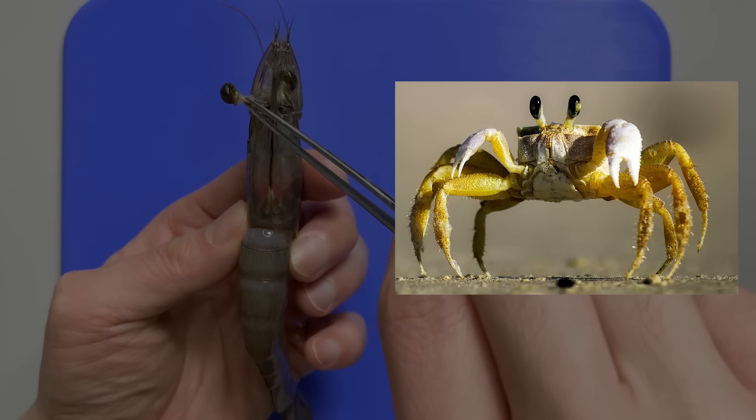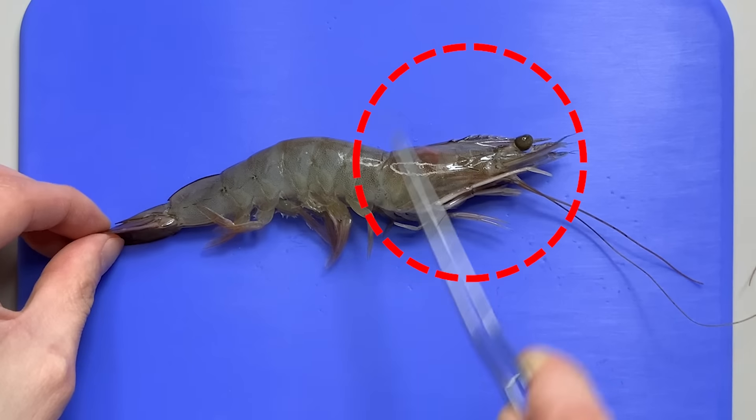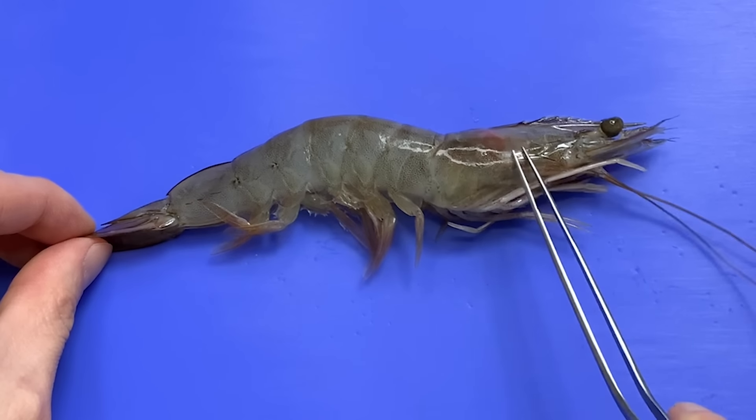First of all, if you look at the outside of the shrimp, there's a part you should be careful about when you eat shrimp. It's the rostrum. People use the rostrum to distinguish shrimp species. The rostrum is sharper and harder than you think, so be careful!